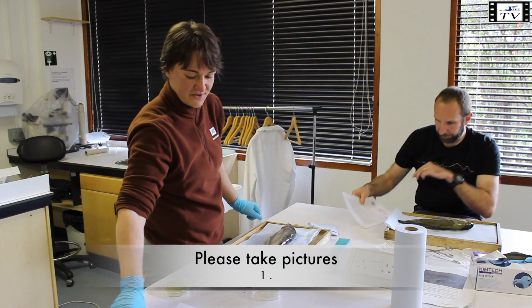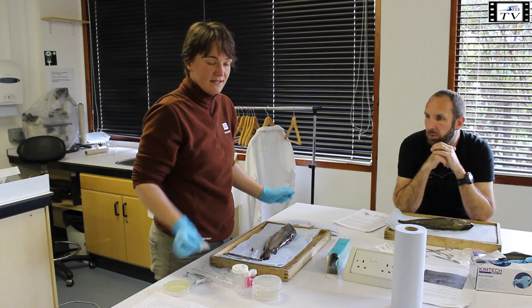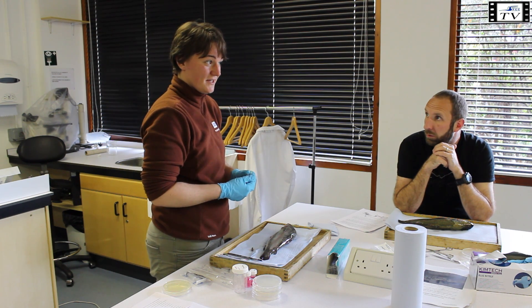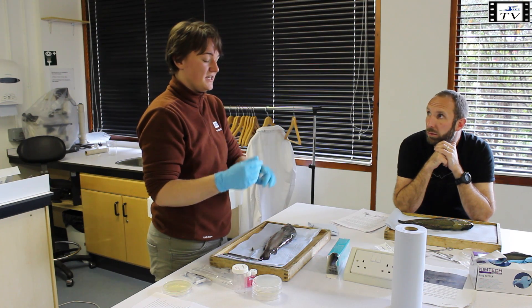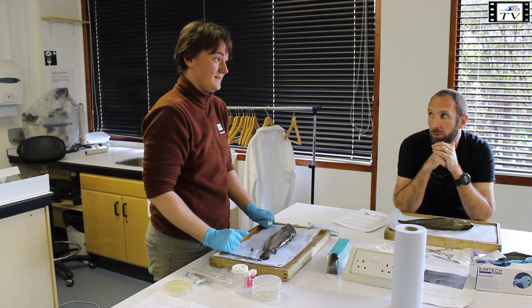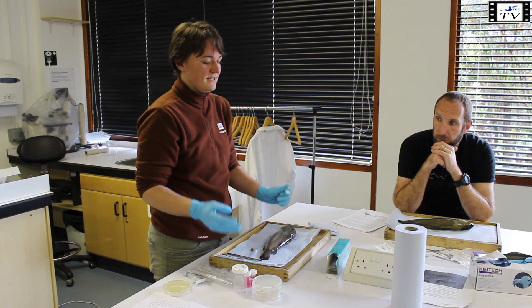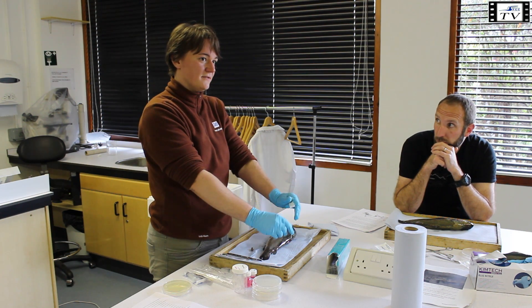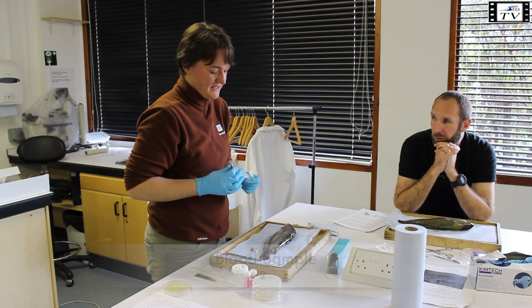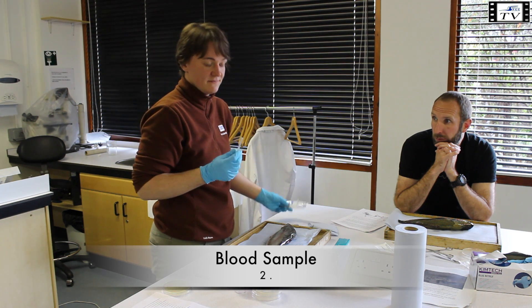First of all, very important for me is taking pictures — that's the first step. Next, it's very important that the samples are very fresh. Otherwise tissues change, and especially for microbiology, if the fish has been lying around at the riverside, it's not much use to take microbiology samples. Ideally the fish is still alive when you arrive; then you kill the fish and take all the samples as quickly as possible. As soon as the fish is dead, you take the blood samples before the blood starts clotting.